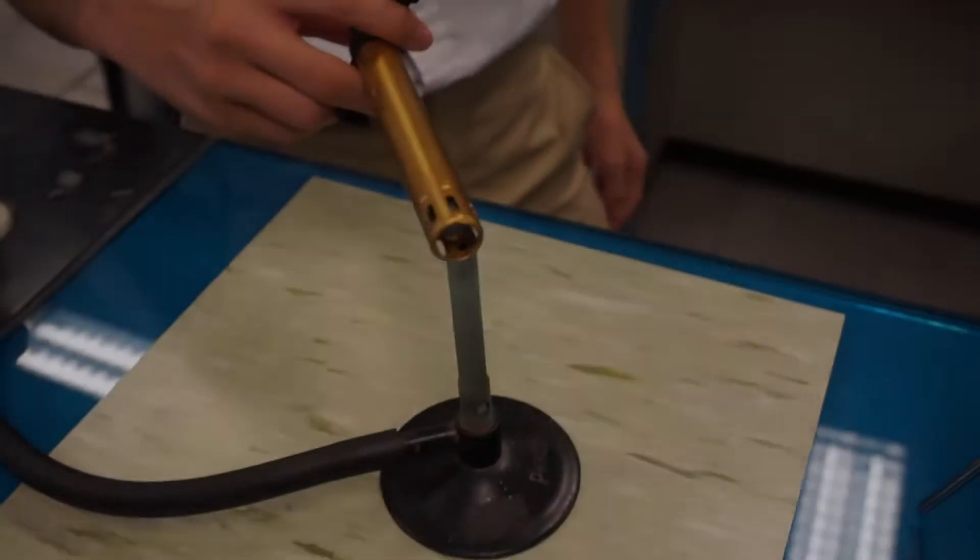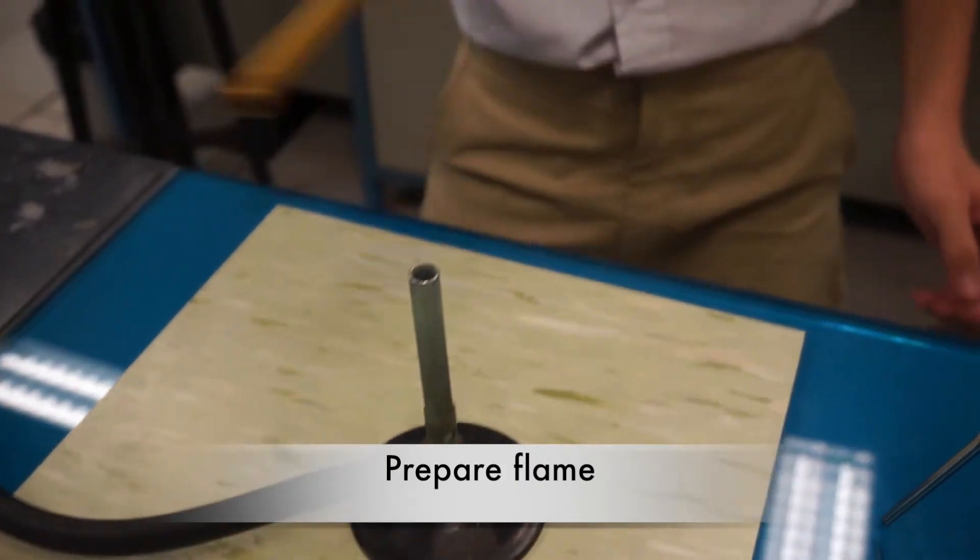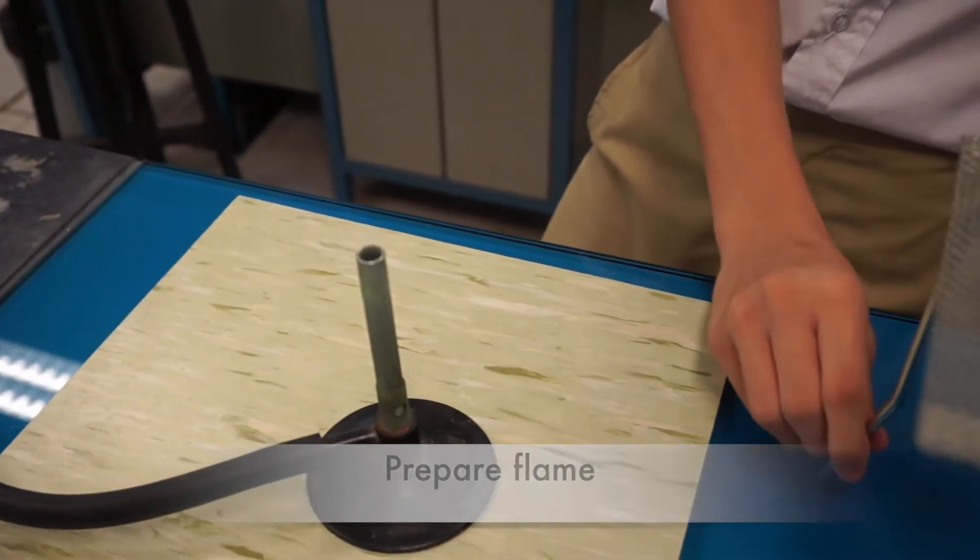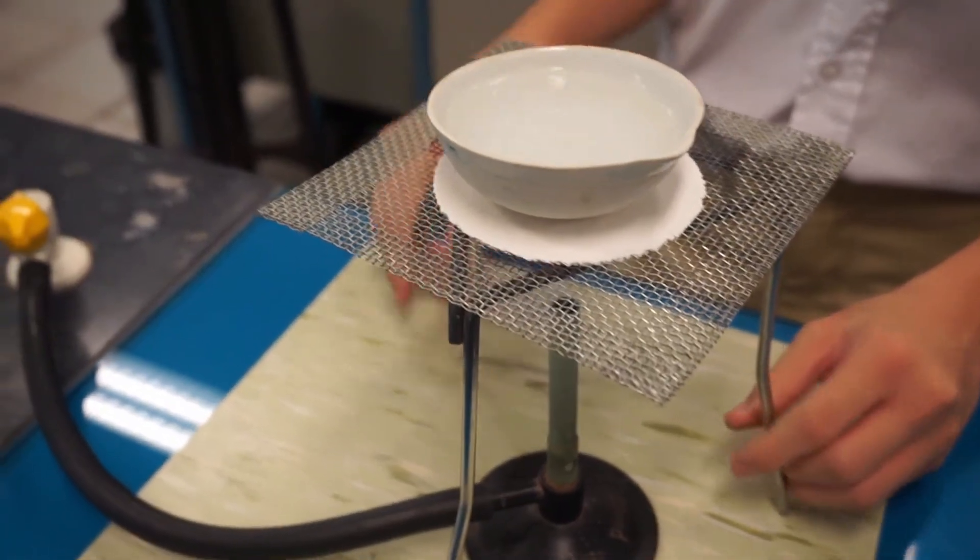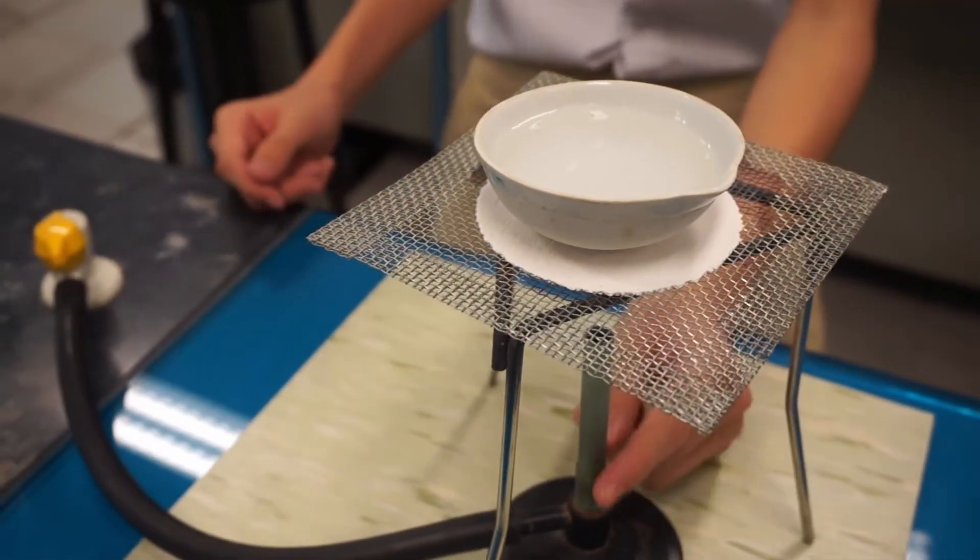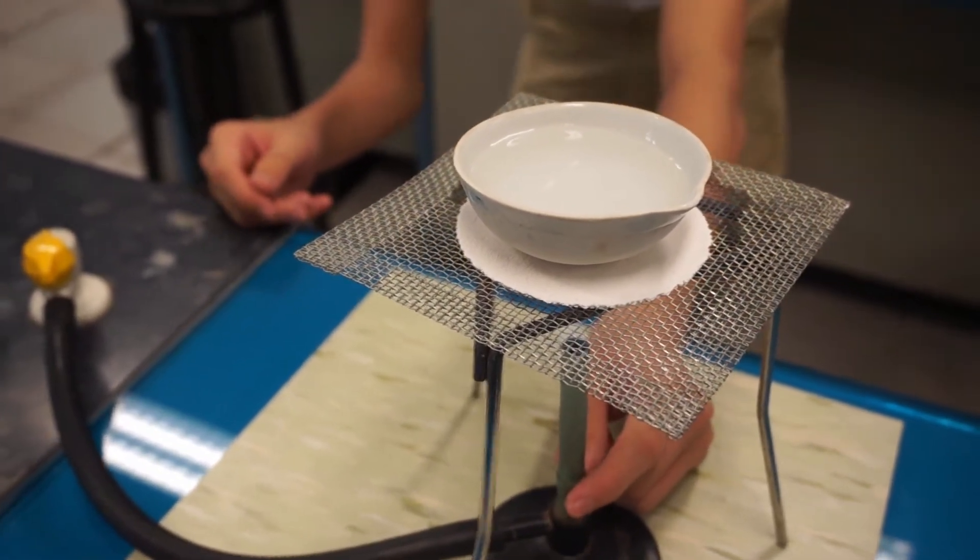Now we will light up the Bunsen burner. Make sure the air hole is closed before this. Next, carefully place the tripod stand over the Bunsen burner. Lastly, you may open the air hole to enhance the flame. The last part, waiting.